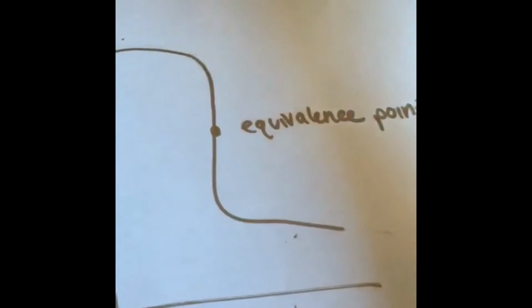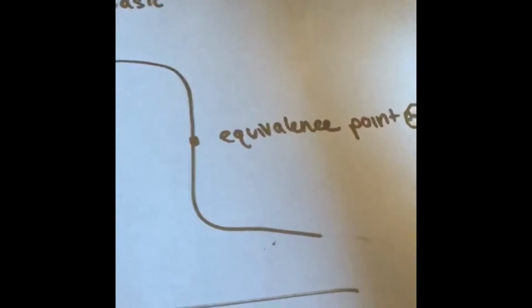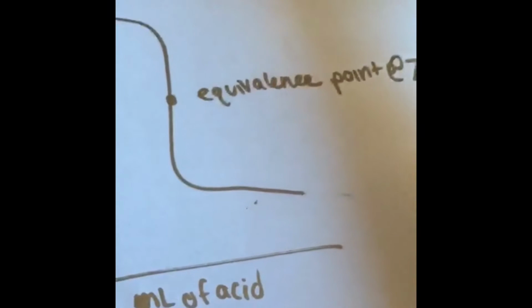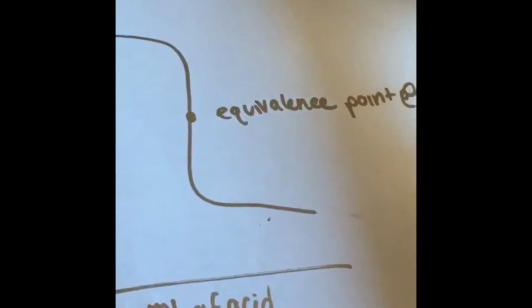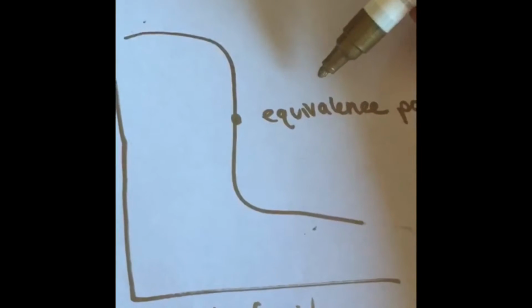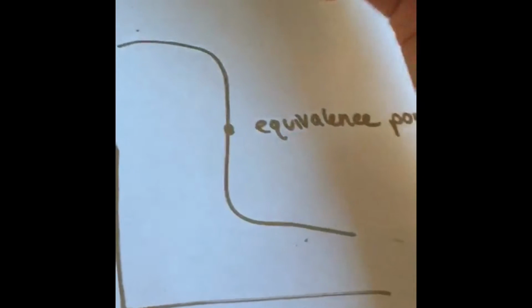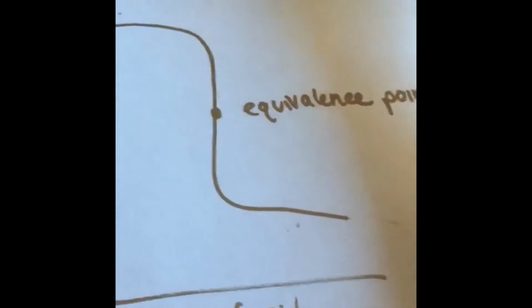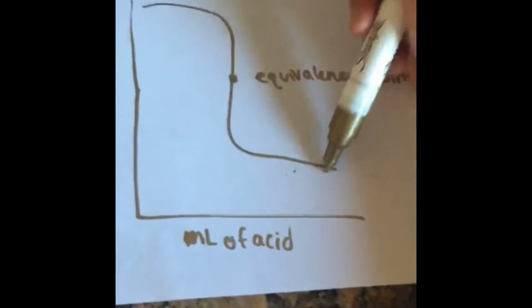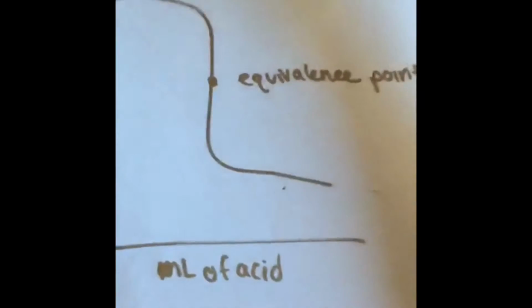If you had a weak acid or weak base titration, that would occur a little bit higher, let's say at 8 or 9. But we had strong acid and strong base. And at the equivalence point, the indicator turned a light pink. Now we bypassed that in our chemical demo for dramatic effect. We went directly into excess acid where the pH was quite low and the indicator turned a very bright pink.